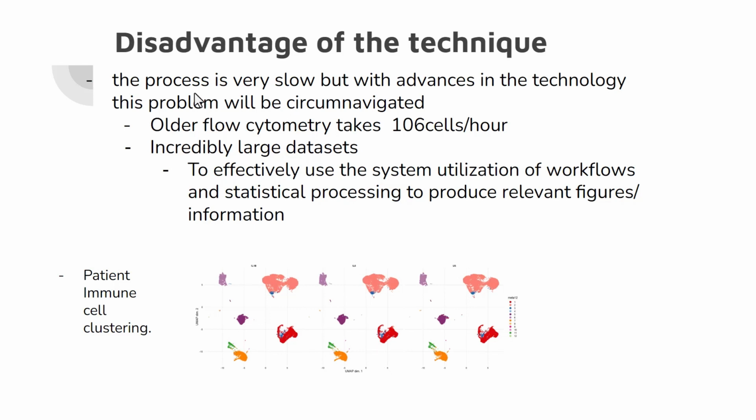Hopefully, as time goes on, the technology will progress and the speed problem will be circumnavigated. Really, to analyze these data sets, there must be incredibly efficient workflows in place and statistical processing models to actually interpret these large data sets.